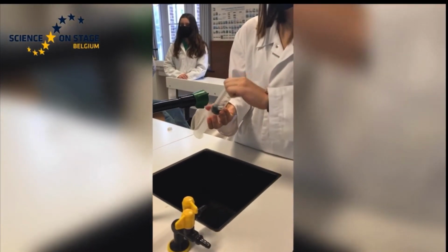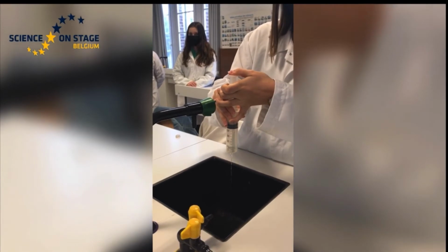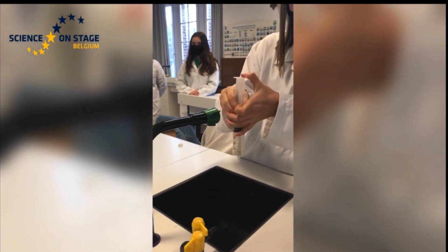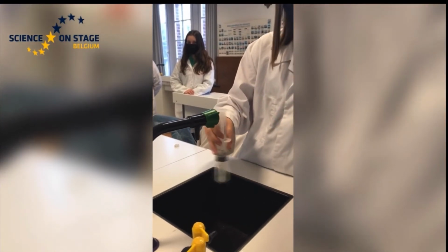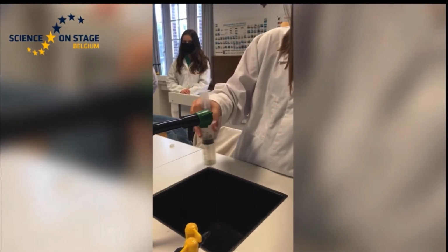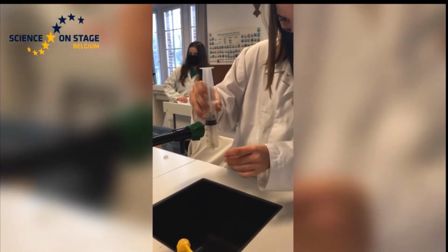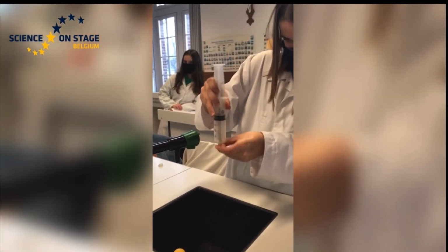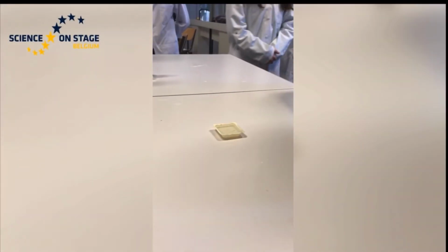So we open the syringe and turn it over very quickly downwards, and we must keep it as vertical as possible. Indeed, hydrogen is lighter than air and tends to leave the syringe. We push the piston to eliminate the liquid, and only the liquid. Be careful to keep the gas in the syringe. The syringe containing the dihydrogen is recapped.